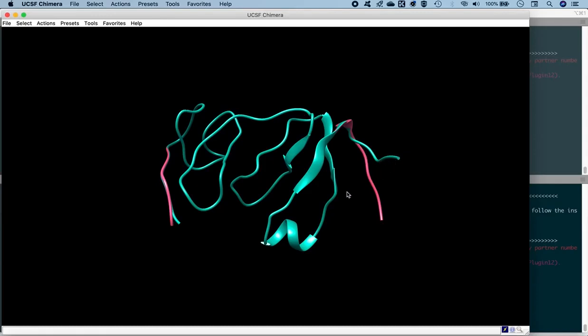So that's great. You have a refined loop region, and we reconstructed the loop region at first, and that's how you generate the missing residues of a PDB file in a short fragment. If you want to reconstruct them by PyMol, the missing residues necessarily have to be fewer than 10 residues.